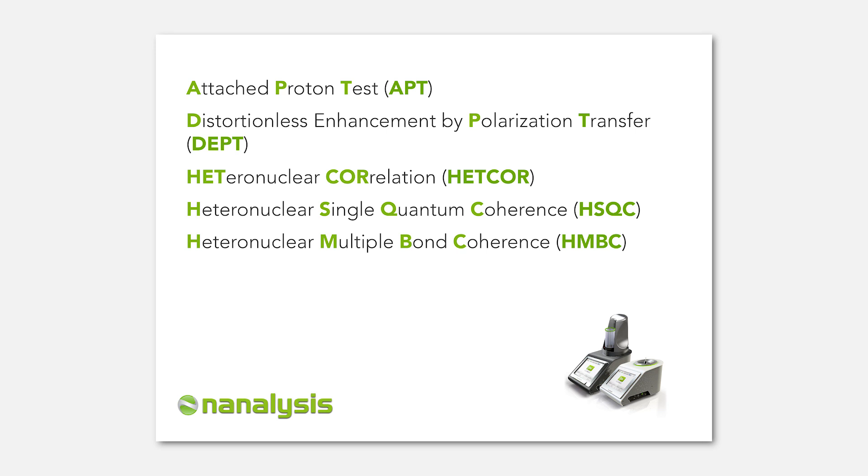For this video, we will talk about the considerations needed for running regular 1D carbons and DEPT experiments. Although the NMR-Ready 60 Pro has a touchscreen, for the purpose of this video, I'll be using a mouse so you can see what I'm doing.